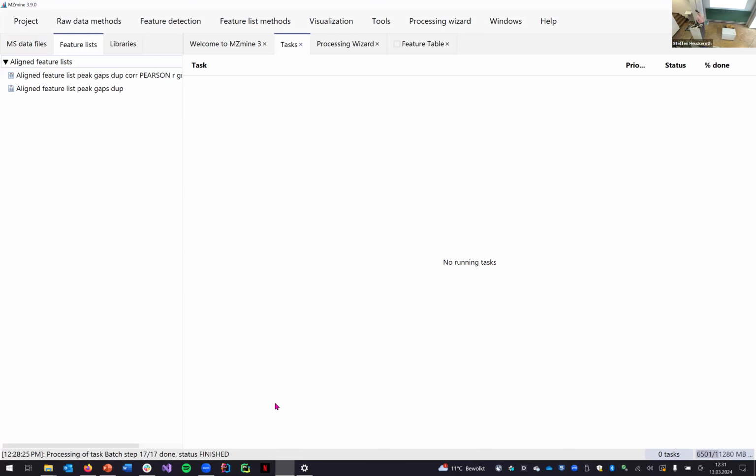Yeah, do you know MZrep? The question was, can you use some other tools to optimize the parameters and maybe make them comparable between different softwares? Between different softwares is really hard. I don't think you can do that easily, to use something to optimize the parameters.